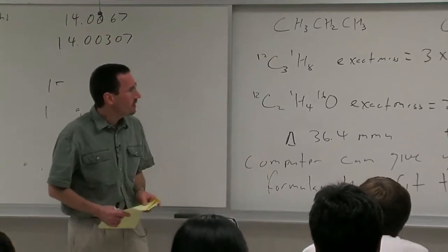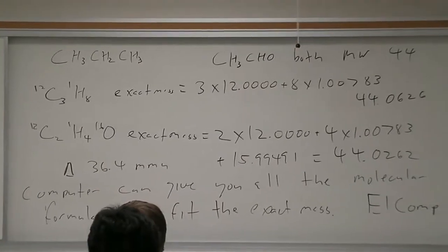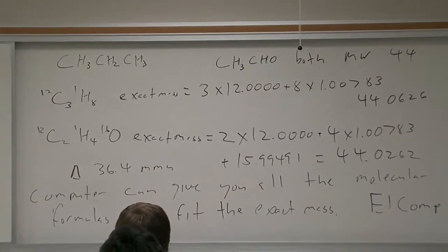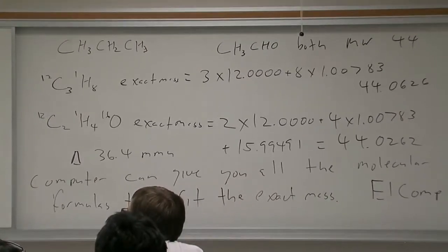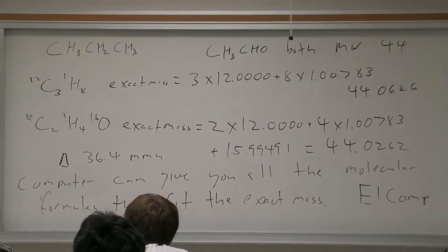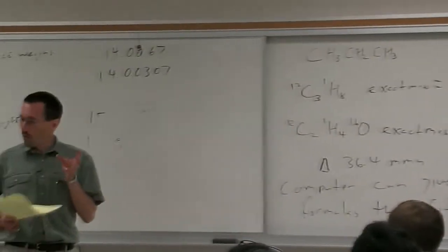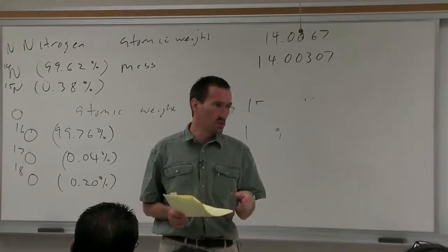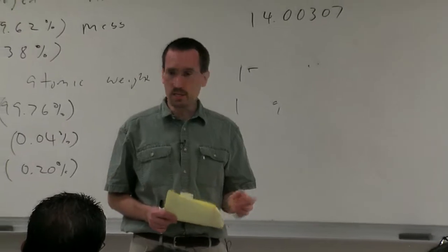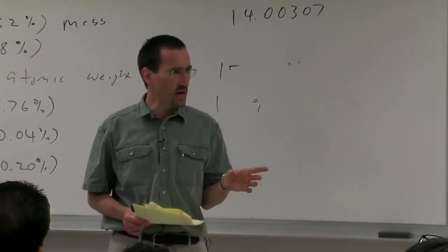Now, typically in small molecule mass spectrometry, the journals basically say above 1,000 molecular weight, don't even bother to do high resolution mass spectrometry. Because for small molecules like 300, you really will get unique formulas. But for much bigger molecules, you may have many formulas that fit. Now, what's interesting is with ion cyclotron resonance techniques, you get about an order of magnitude higher precision.